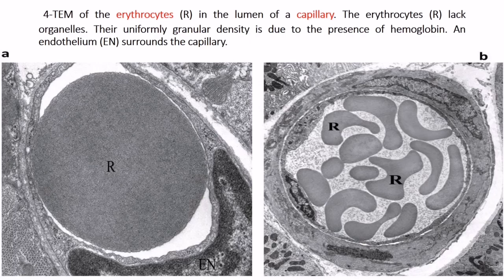Here is a transmission electron microscope image of the erythrocyte in the lumen of a capillary. The erythrocyte lacks organelles, and its uniform granular density is due to the presence of hemoglobin. The endothelium surrounding the capillary is also visible.